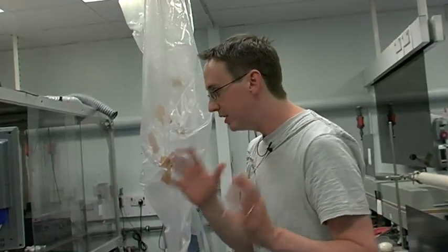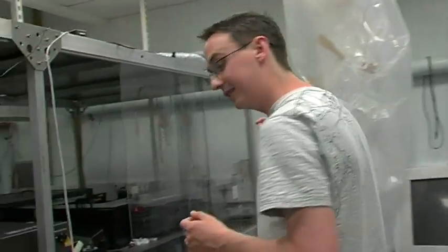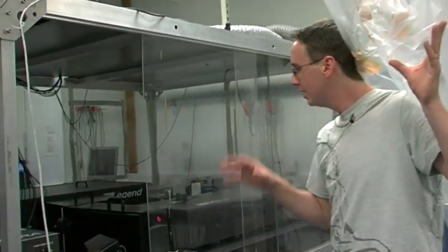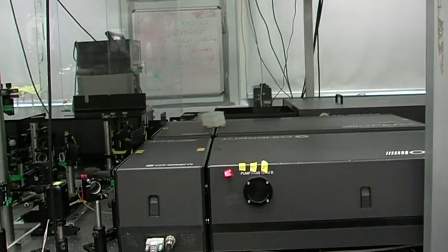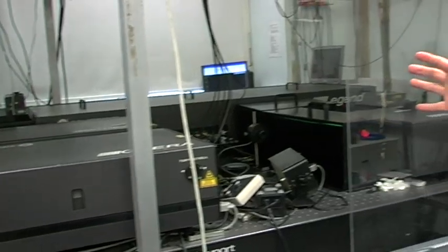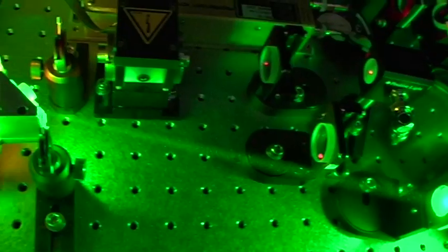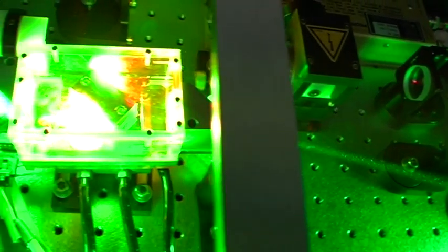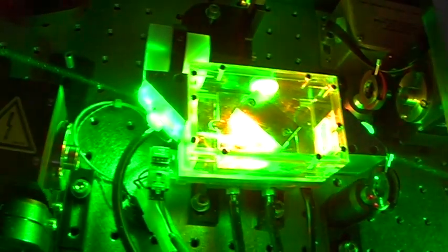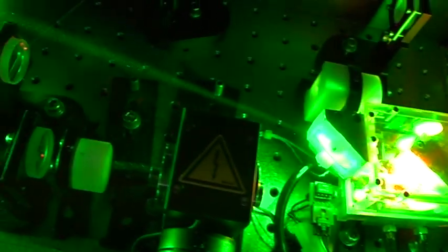In order to do that, we need those really fast laser pulses to catch those really fast pictures. That's what these black boxes at the back here do. They may look like fairly boring black box machines, but inside, there's a really complicated set of optics that are used to produce the right colors at the right times for our experiments to actually work.